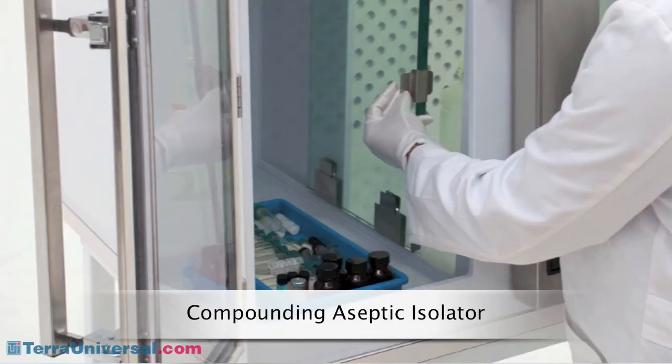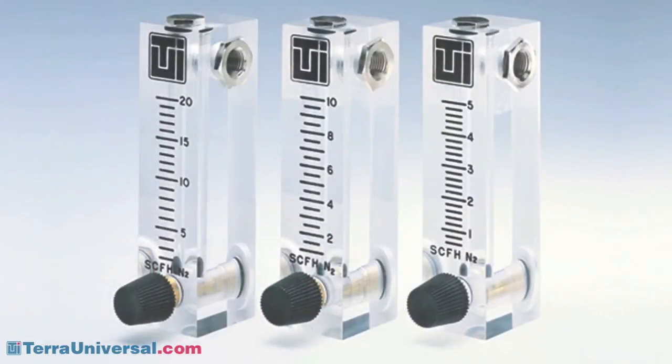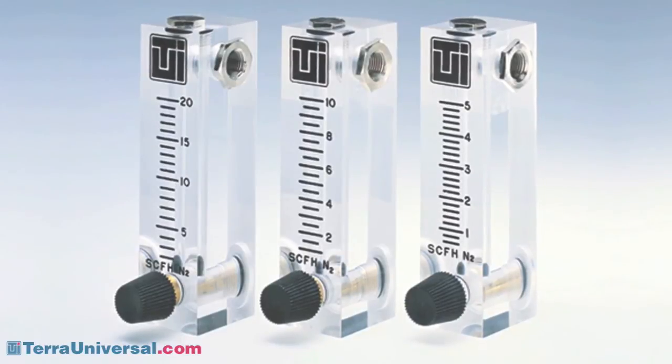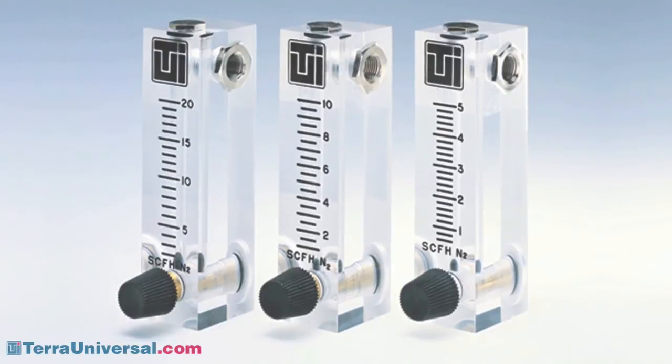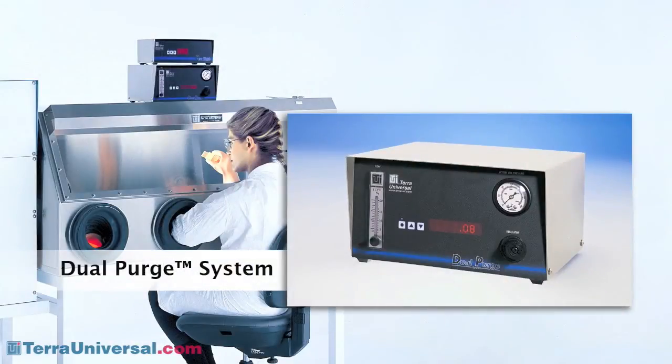Differential pressure gauges display these cascading levels for easy monitoring. Tera offers several humidity control options. A flow meter provides inexpensive gas purging without set-point control. The dual-purge system delivers a variable nitrogen purge. As long as anti-chamber doors are closed and the unit maintains stable pressure, it restricts flow to conserve gas. When a door opens and pressure changes, it switches to high flow to remove moisture quickly and efficiently through an automated relief bleed valve.